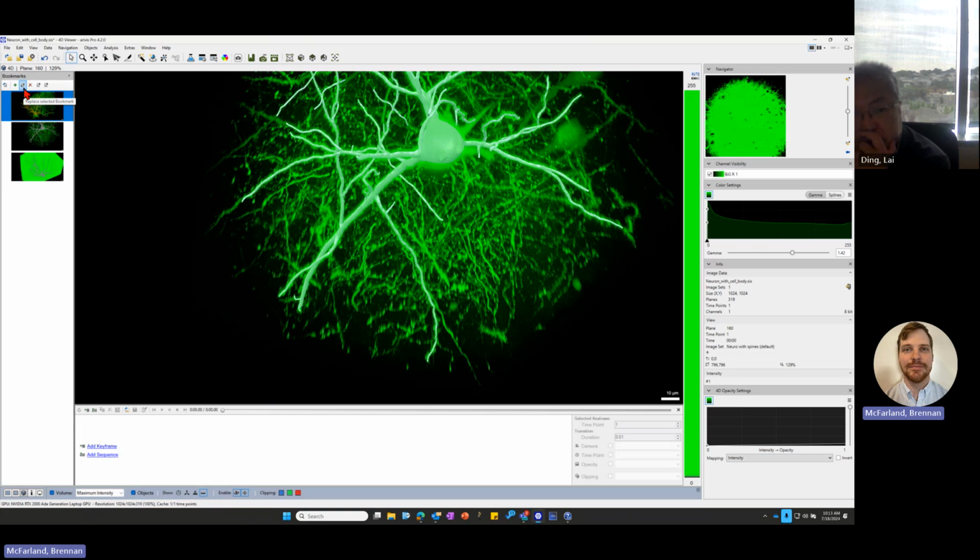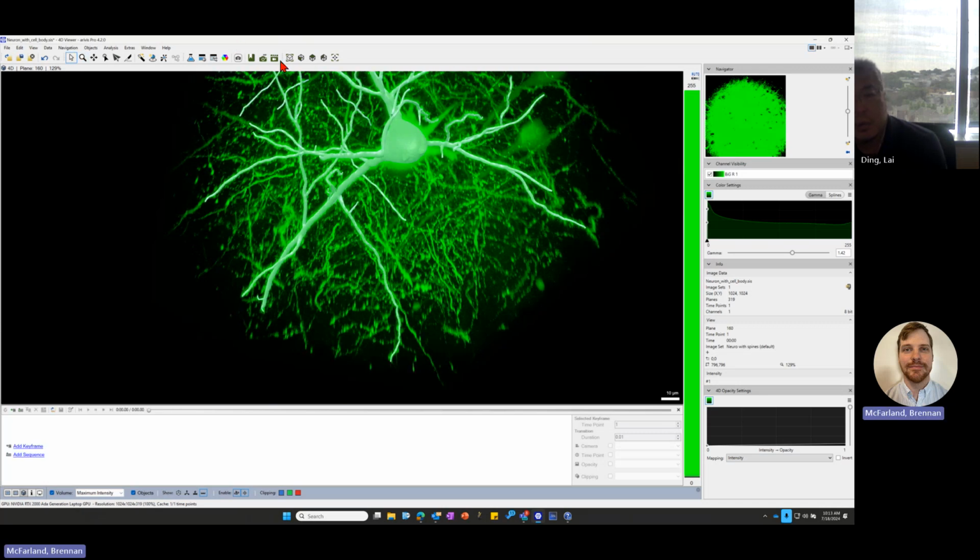There's this button to replace the selected bookmark. So if I have this here, I just press this button, and it's going to replace it. And then we can also take in bookmarks and export these. So if you're working on a different computer, or maybe two people are working on a project together and you want to send them the bookmarks and everything, a pipeline, and have them recreate everything, all of those settings are going to be saved within here too. Okay. And that's it for bookmarks, really simple.